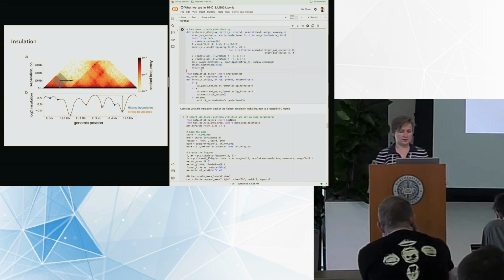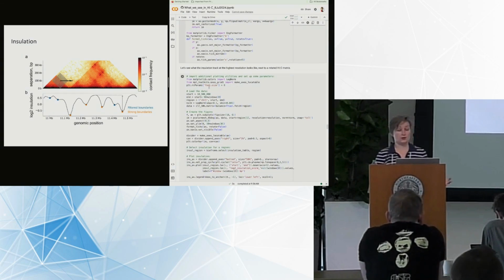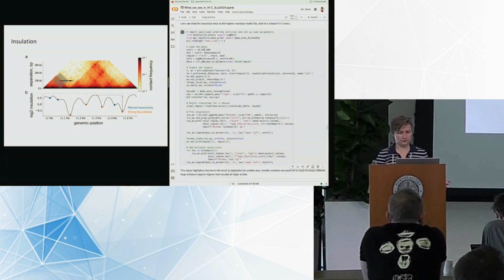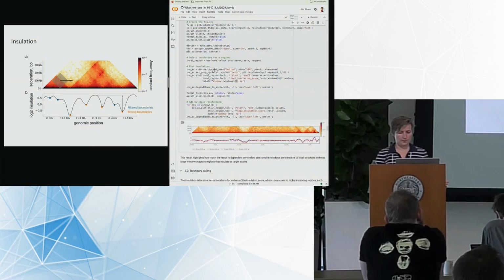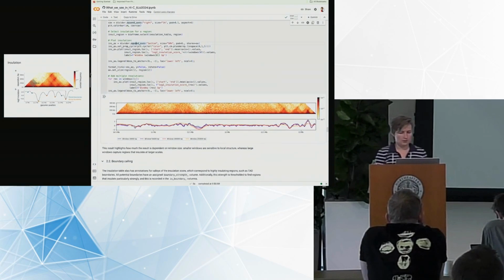And you can also do the same in your code. It's the function 45 degrees rotated color mesh here. So you can just execute it and use it in the next cell. Here it goes. I will zoom it in. You can see an example of a Hi-C region where you can already appreciate that there are some boundaries and there are different levels of strength.